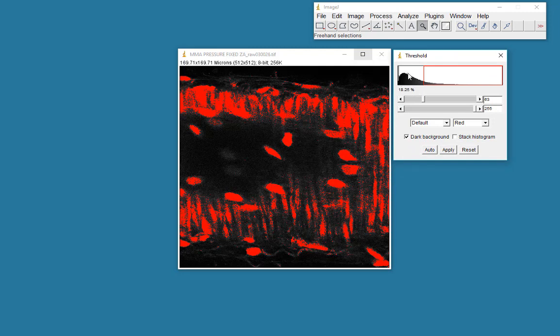Now there's a histogram showing here. And it's perhaps worthwhile to spend just a minute or so talking about the histogram.